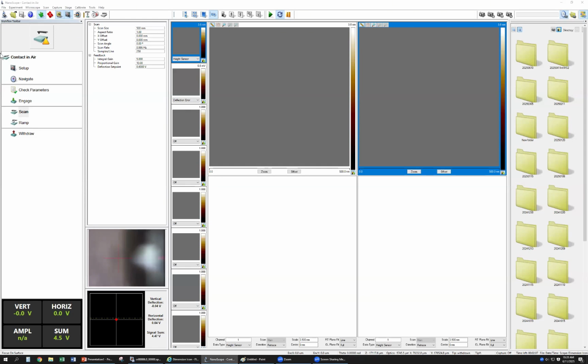Okay. So before you engage on the surface, change this one to the small value. Change to this smaller value. This value you should compare with this value. If this value is quite bigger, then that means you didn't adjust this red point to the center. Then the force just can engage on the surface enough, because this one is quite a hard sample.